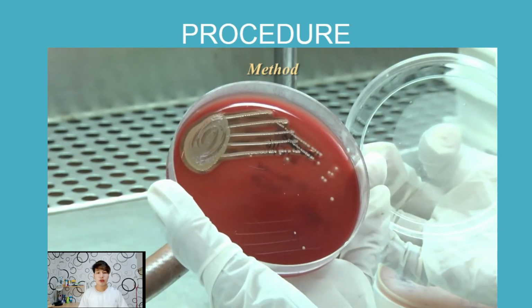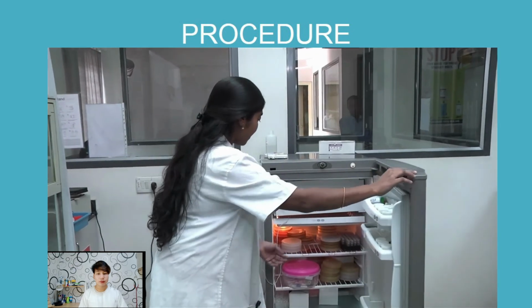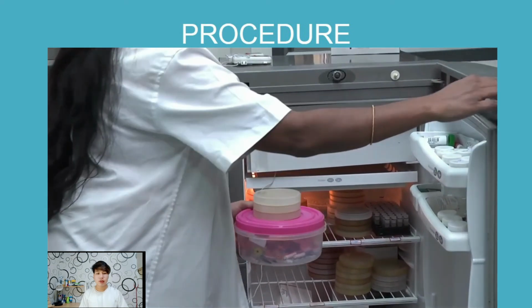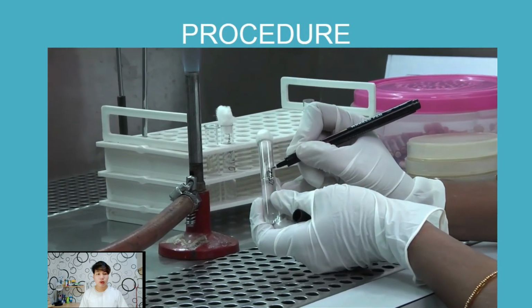The prerequisite for any AST procedure is the presence of the isolated bacteria from specimen obtained from the patient. Wear your PPE and culture specimen on appropriate media. Incubate overnight to get isolated colonies of bacteria whose sensitivity is to be tested. Remove the MHA and antimicrobial disc from the refrigerator and allow to stand at room temperature for 20 to 30 minutes. Wear your PPE and label the tube containing the nutrient broth, mostly TSB, in which the colony will be suspended.